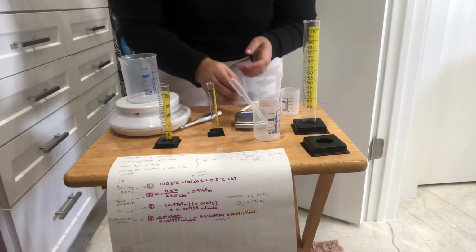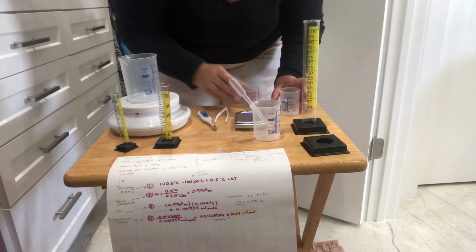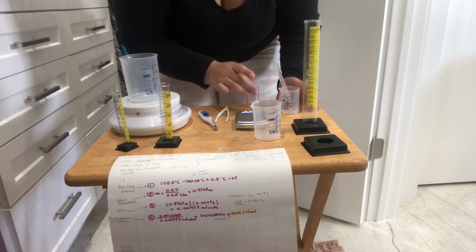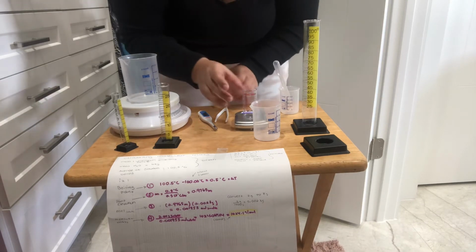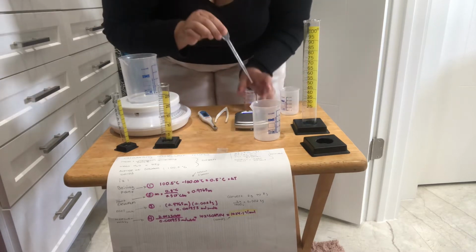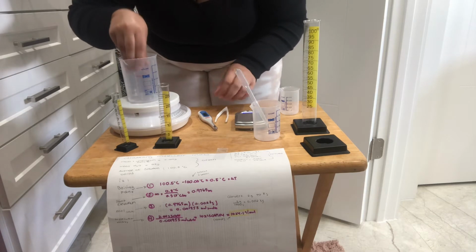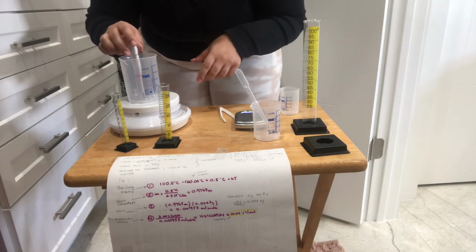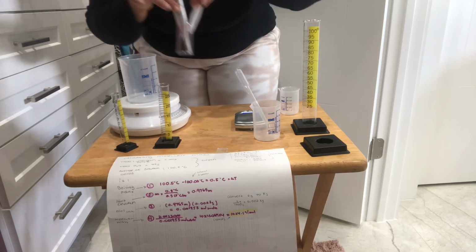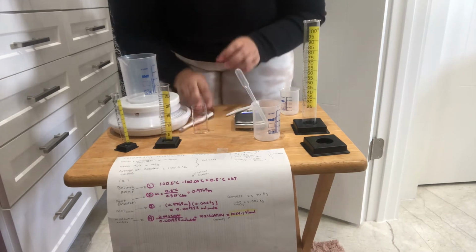3 and 4. So for example, for test tube 3, we're going to weigh the test tube. Then we're going to transfer 1 milliliter of the unknown solute. We're going to weigh the test tube with the unknown solute. Then we're going to take 10 milliliters of the ethyl alcohol, place it into the test tube with the unknown solute, agitate it, and then we're going to place it into the hot bath, and we're going to take the temperature, and then we're going to take it out with our test tube holder, and then we're going to let it cool and take the temperature of that. And we'll repeat the same step for test tube 4.